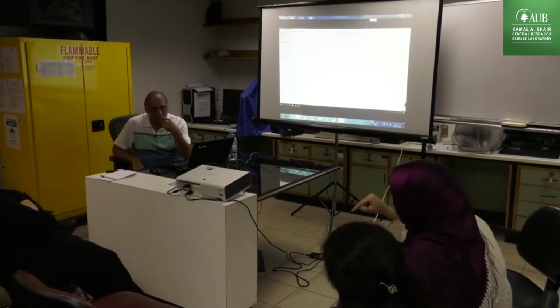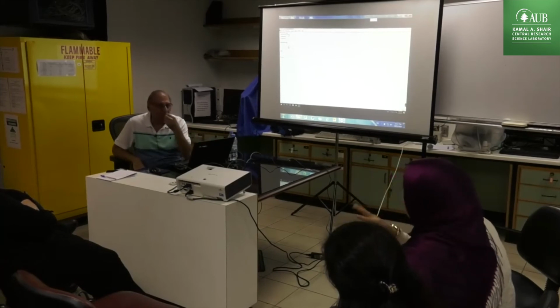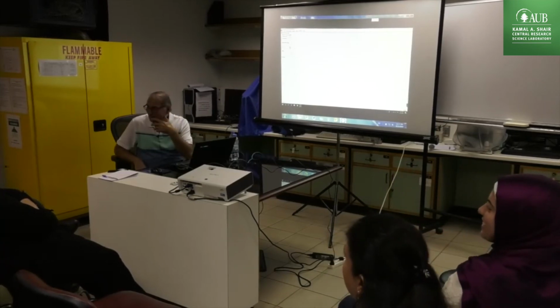And if you use the same cell again, we can only input it here. So every user has his own. He has to buy his own cell. Only in case of large masses we have to take into consideration the difference.